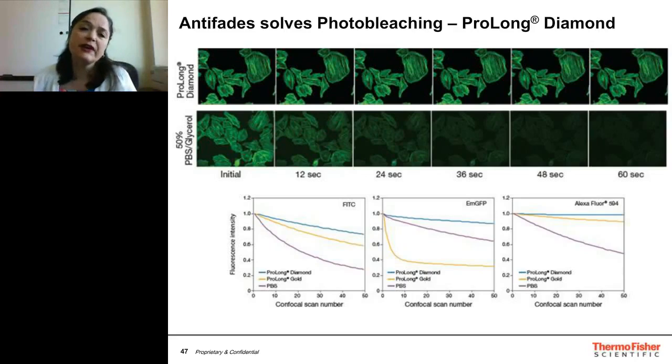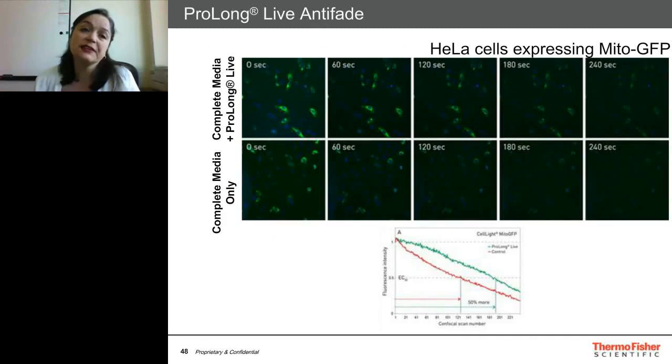If you have issues during live cell imaging, it's a little trickier, because a lot of those antifades that prevent photobleaching can also be very toxic to cells.